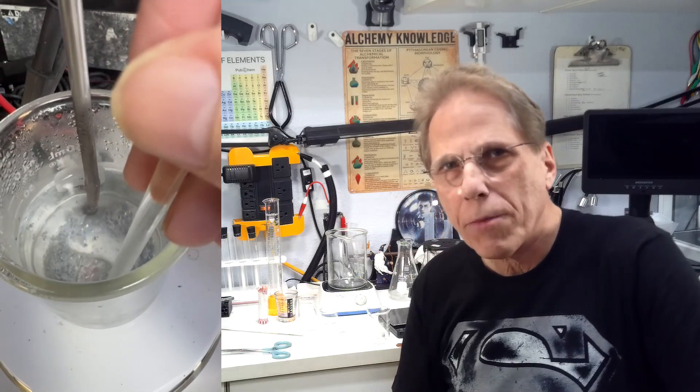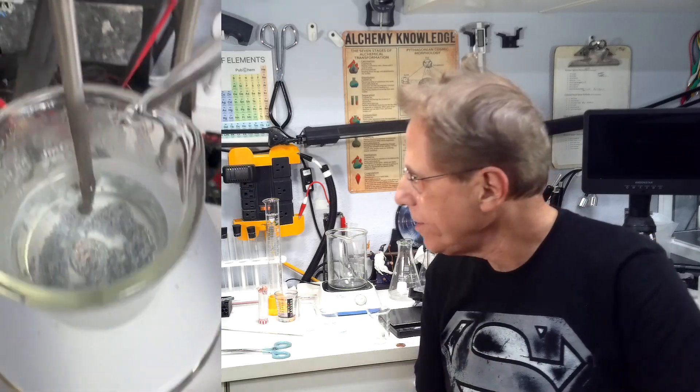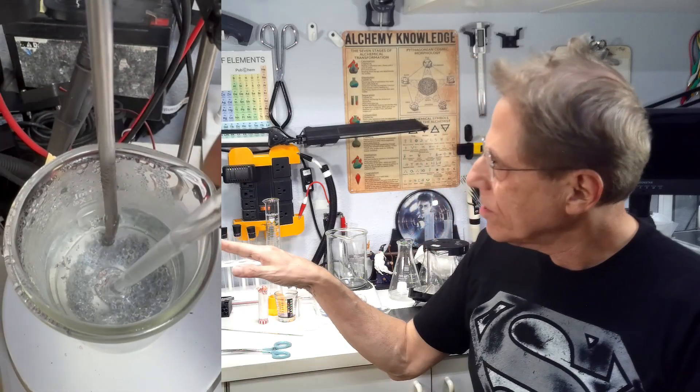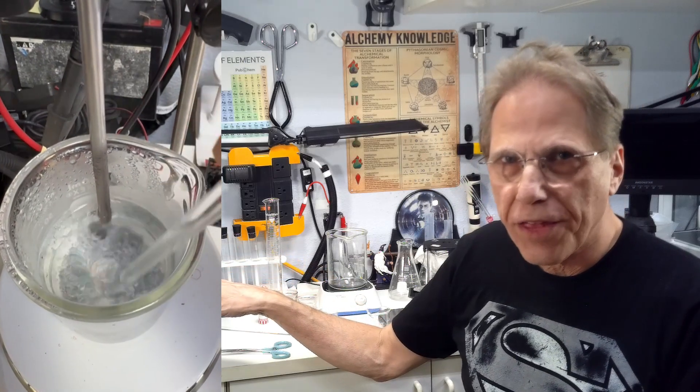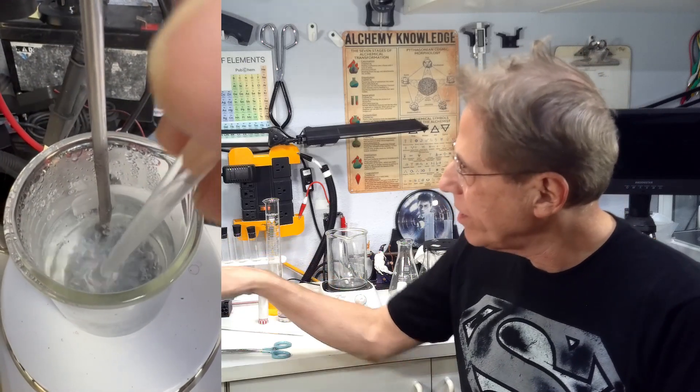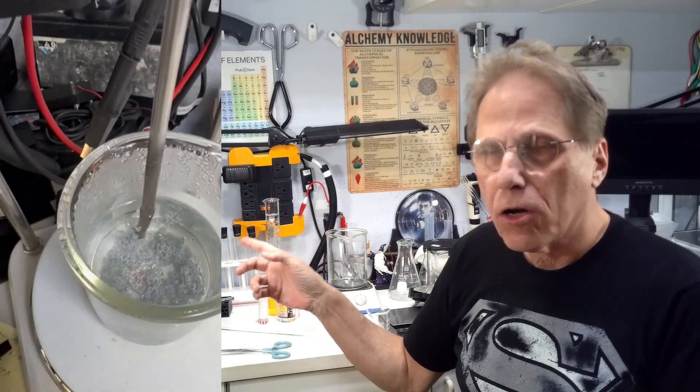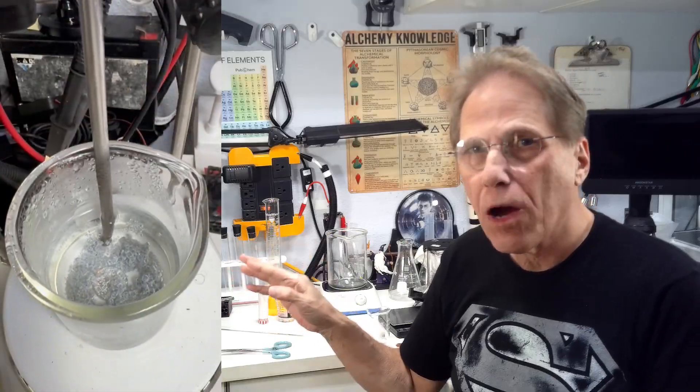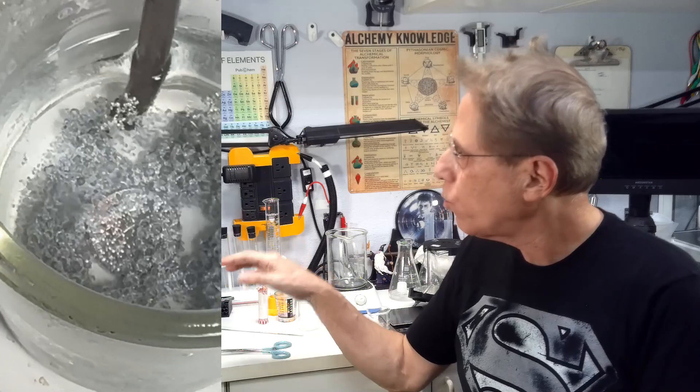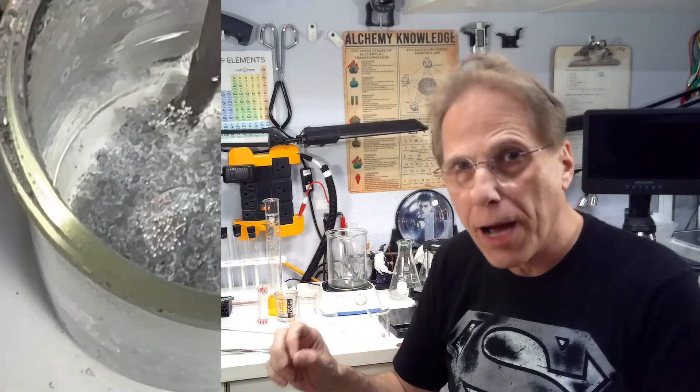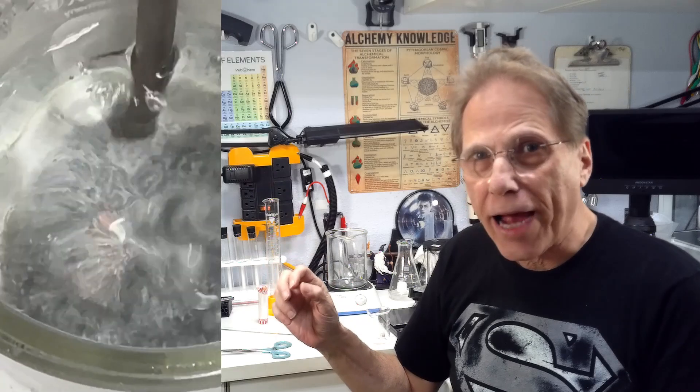Well, that penny is being coated. Let's talk about the chemistry behind what's happening here. We got zinc chloride in there and we have zinc metal filings. Now, what's happening is the zinc chloride is providing the ions, the zinc ions that will attach itself to the copper penny.